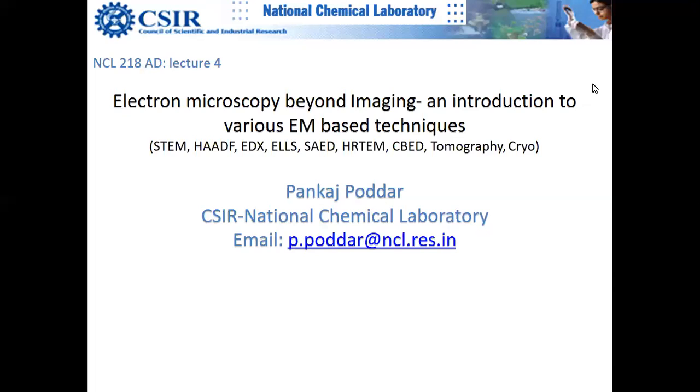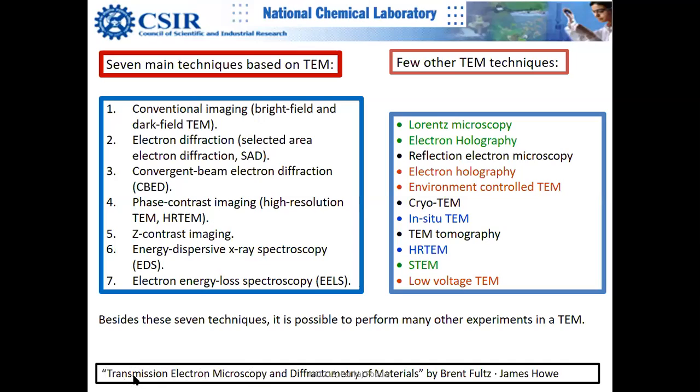So today we are going to dive deeper into various EM-based techniques, and you will be excited to know there are so many techniques other than what you know. So here are the different techniques based on transmission electron microscopy. Of course, there are many based on scanning electron microscopy, but that will be taught in a separate lecture. So let us go one by one slowly so you can understand. And if at any point you have any questions, please do not hesitate to ask me.